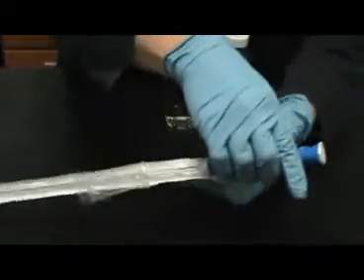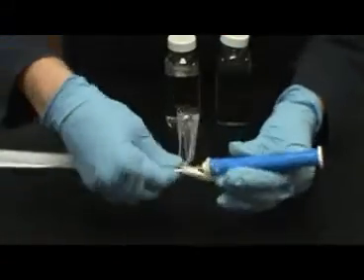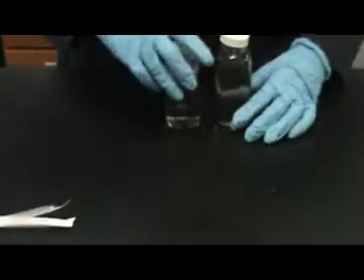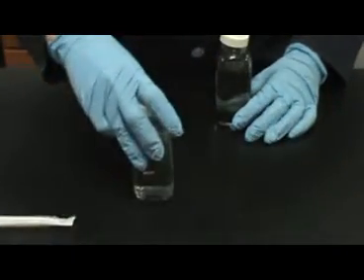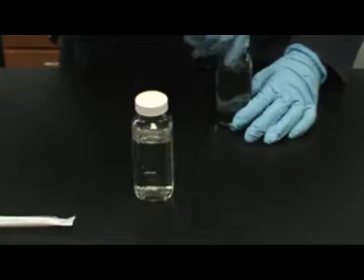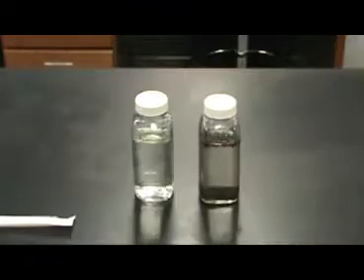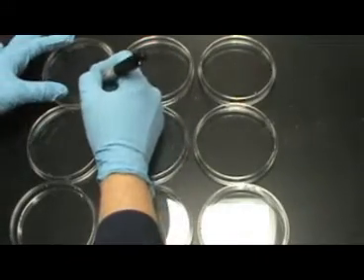Place the used pipette back in the sleeve and remove it from the pump. This should be disposed of in the biohazard. This second dilution will have a dilution factor of 10 to the negative 4. You are now ready to label your plates.